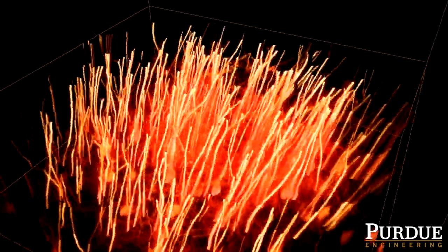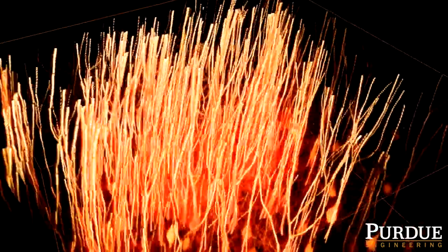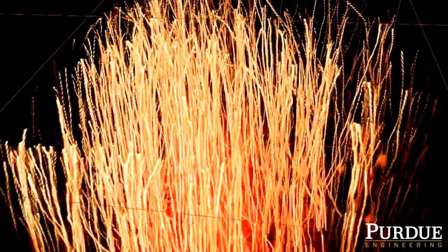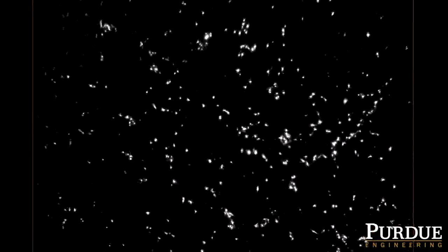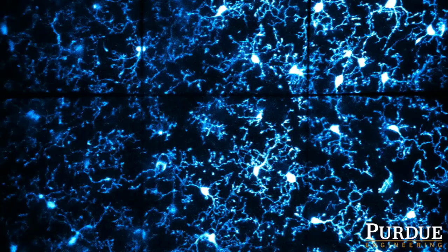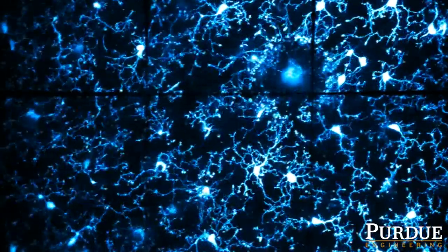In neuroscience, people want to figure out how the brain works. You want to understand how the information flows inside the circuits. And with modern calcium indicators, you can really capture the neural dynamics as a function of time. Therefore, you can really see how the neurons think in real animals.